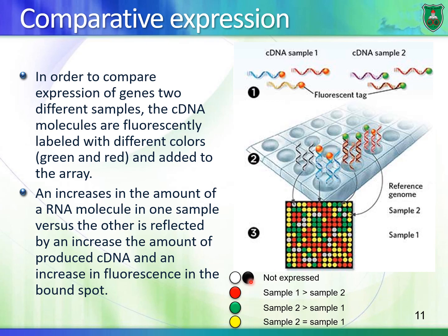Let's say that sample 1 contains more messenger RNA than sample 2. It means that we will have more cDNA of that particular gene in sample 1 than sample 2. And you will have red fluorescence, okay? And you would get something like this in these spots right here. Let's say that sample 2 has more messenger RNA slash cDNA than sample 1, so you will have more green fluorescence than red fluorescence. So let's say that expression is equal. It means that there will be equal amount of fluorescence emitted from any particular spot, and the computer gives us a yellow color. Okay, so these are the probabilities. So by doing this, we can relatively see the changes in expression of all genes at the same time, which is quite amazing, right?